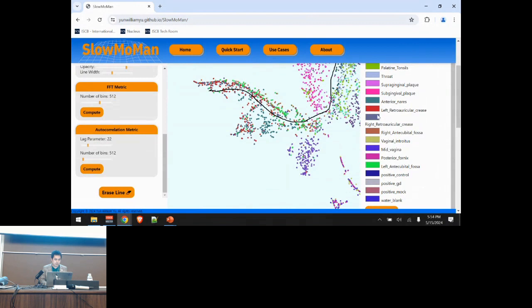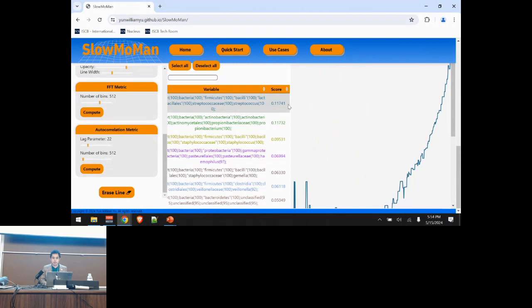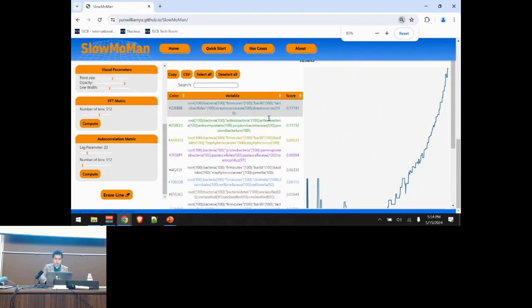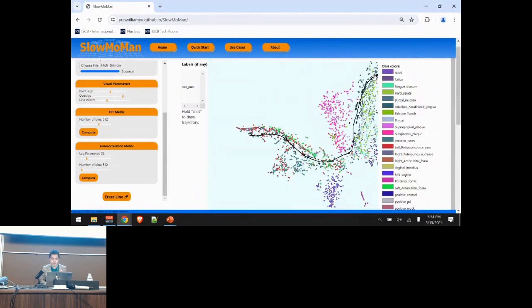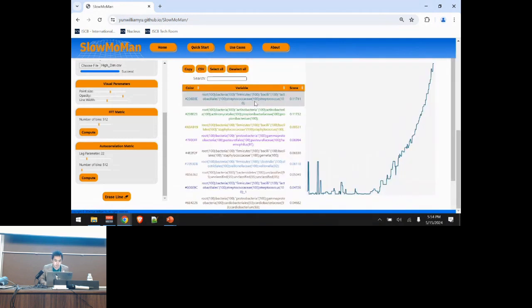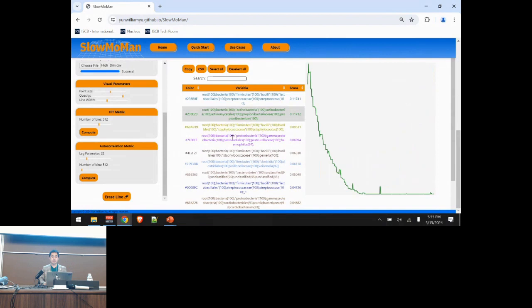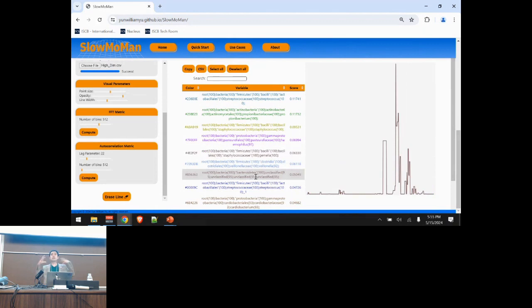So over here, I think I was starting, sorry, let's click that button. Ah, there. So can I zoom out? Okay, yeah, so here you can see that along this particular path that I've chosen, that ended up here somewhere around the hard palate and the mouth, over there you see lots of streptococcus as part of the bacteria that's present in that sort of sample. And you can sort of see the differences along these paths that you've chosen in your t-SNE, which different bacteria seem to be explanatory of where you are.